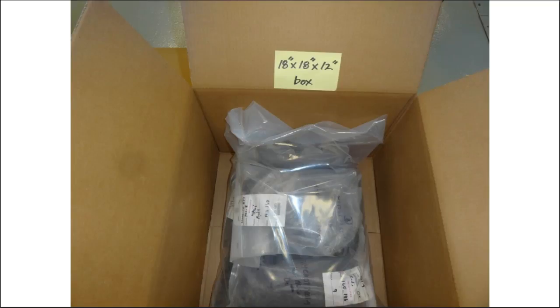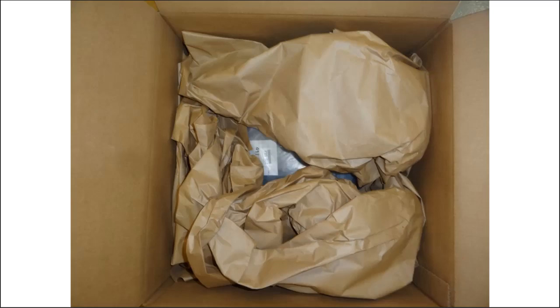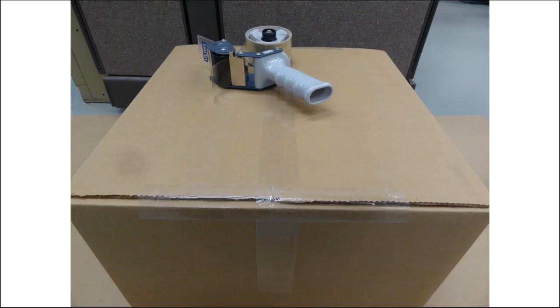They're special ordered. We used to have to make special orders for them. Then during shipment, we don't want those samples to jostle around and move, because some of the workers in the shipping companies tend to toss boxes around in trucks, so we want to fill all void spaces with paper or packing peanuts or something like that to avoid shifting of the contents during shipment. And then this is where you'll need some heavy-duty packaging tape, which we won't provide to you, to seal up that box.